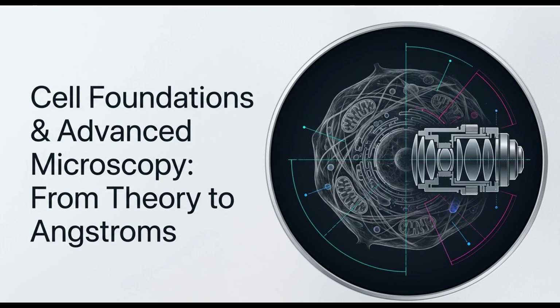Okay, so in biology, cells are recognized as the fundamental units of life, right? Every living organism, from single celled bacteria to complex multicellular organisms, is built from cells. So understanding cells has been one of the greatest achievements in science, made possible through the development of increasingly powerful microscopes. Early scientists would only observe basic cellular structures, but modern microscopy techniques now allow us to visualize organelles, proteins, and even molecular complexes at near atomic resolution.